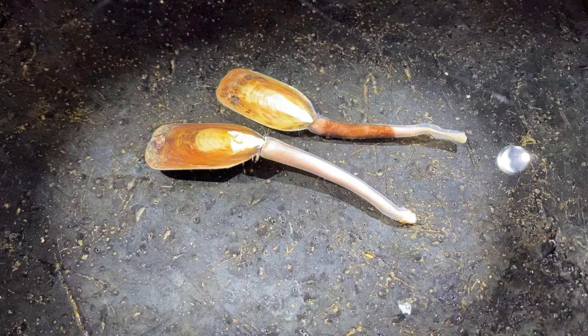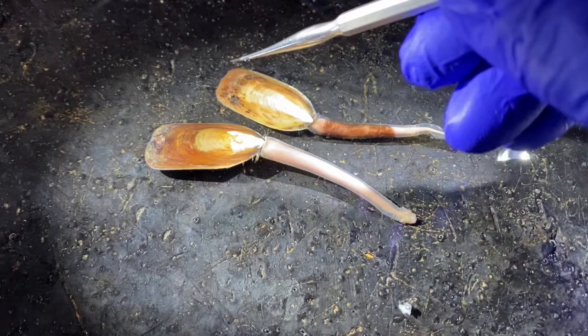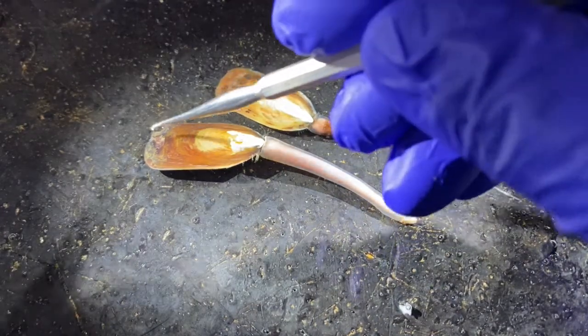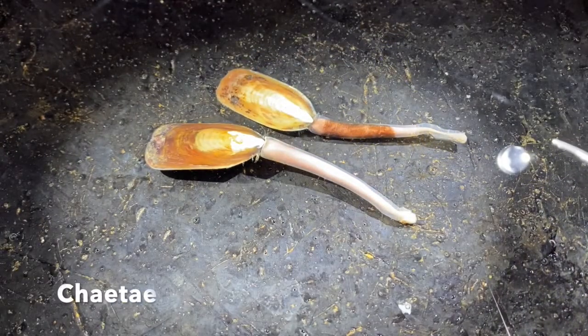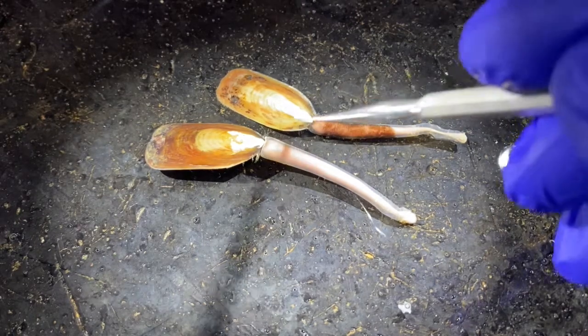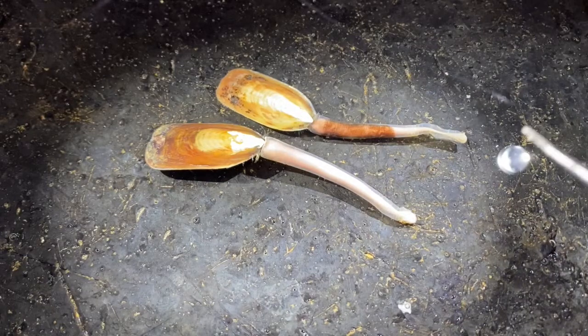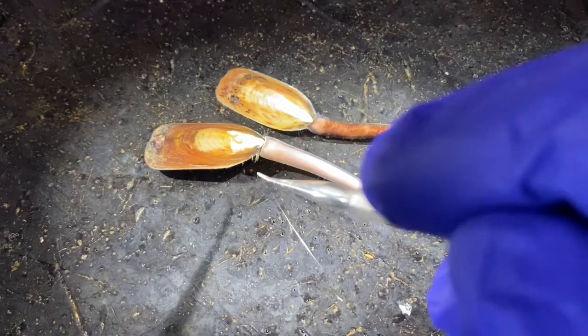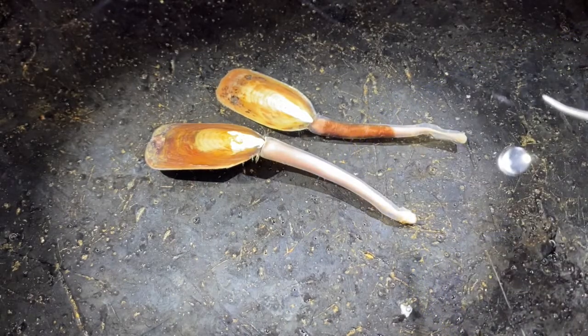So some of the things that you could see in this species if you had a live specimen is that around the margins of this shell, especially up here along the uppermost margin, would be prominent bristle-like structures called chaetae that extend out. You could also see chaetae along these lateral edges. And also chaetae are prominent in some cases. You can see some here in this specimen at the junction between the shell and the pedicel.